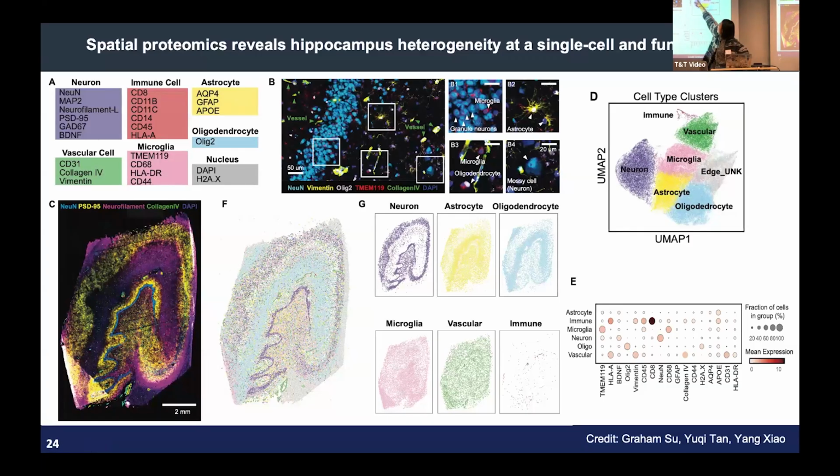It's easy to tell. But for astrocytes and microglia, it's more tricky because they share a lot of the markers. And depending on their state, whether they're homeostatic or reactive, they can have very distinct functions. So for microglia and astrocytes, you could see that many of the markers are shared, for AQP4 or for TMEM119, microglia have a much higher expression, but astrocytes will also have some expression level.